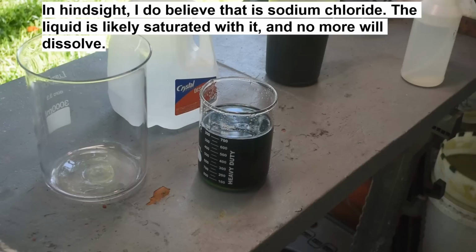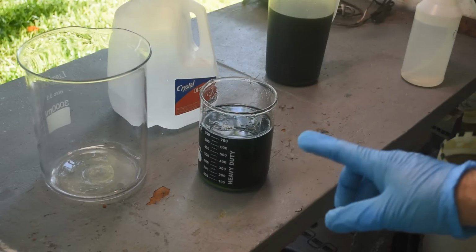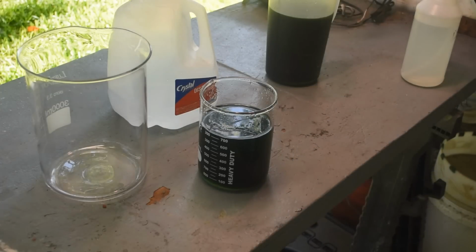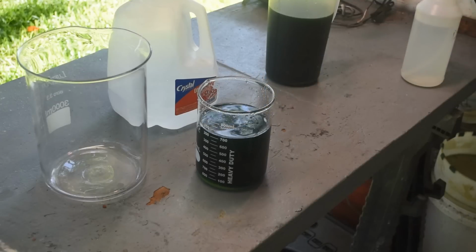Not quite sure what. But I'm just going to let this sit for now. And like I said, do a little research on what that salt on the bottom could be. Let me see if any palladium chloride does settle out of it. And then this liquid will probably go into my stock pot. And at least it won't be lost.